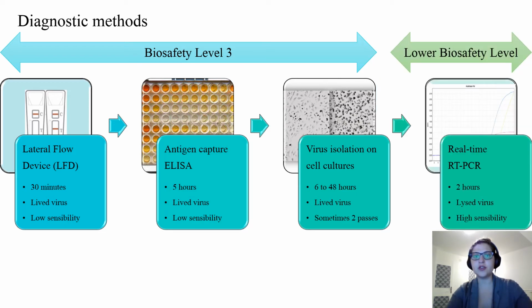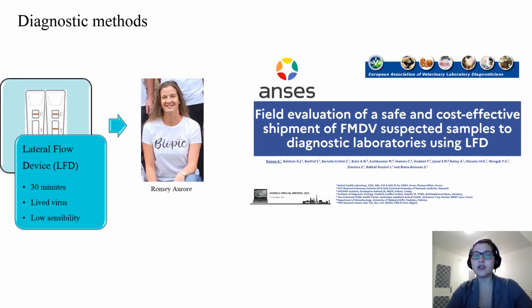The other test to use is the real-time RT-PCR assay, which can be used in a lower security laboratory after release of the viral particles, and therefore not infectious. As a small aside, our team has developed a system for the inactivation of infectious viral particles, presented at EAVLD, and this presentation is given by Aurore Romey.